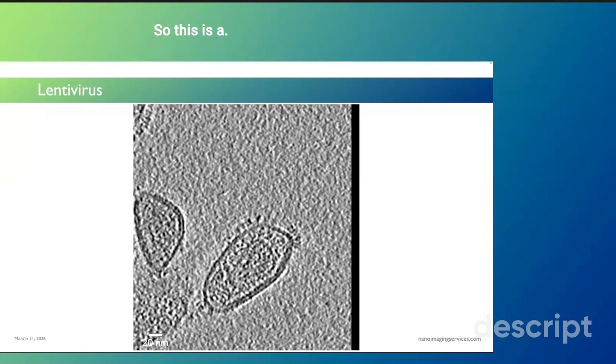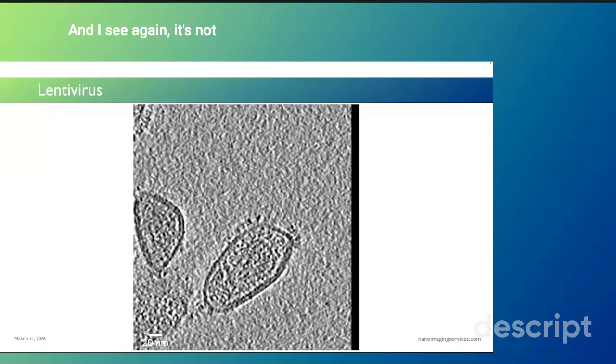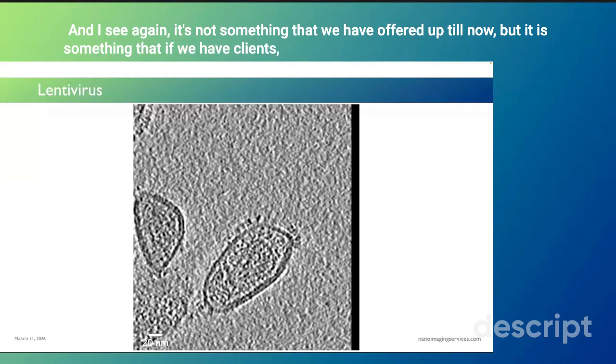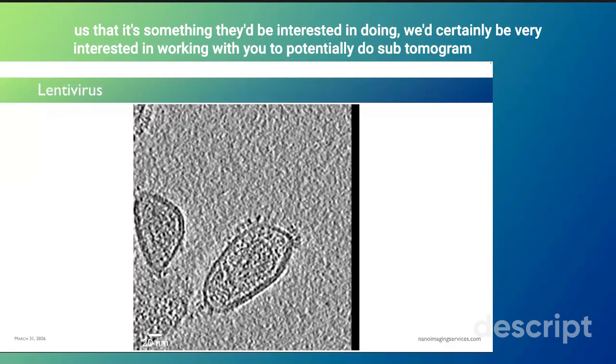So this is a relatively intensive process, both in terms of the data collection and the data analysis. And again, it's not something that we have offered up till now, but it is something that if we have clients, if we have people who come to us and tell us that it's something they'd be interested in doing, we'd certainly be very interested in working with you to potentially do subtomogram averaging.